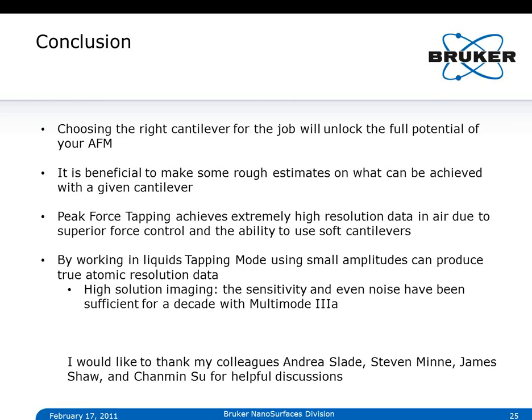If you want to make, for example, a nanomechanical measurement, you have to indent your sample. If you don't indent your sample, you cannot make a nanomechanical measurement, right? So you have to separate probe and mode here, and if we do that, hopefully I've done that here, then you will see that in peak force tapping, you're actually able to directly measure a force. You can measure a force at each single tip to sample contact.